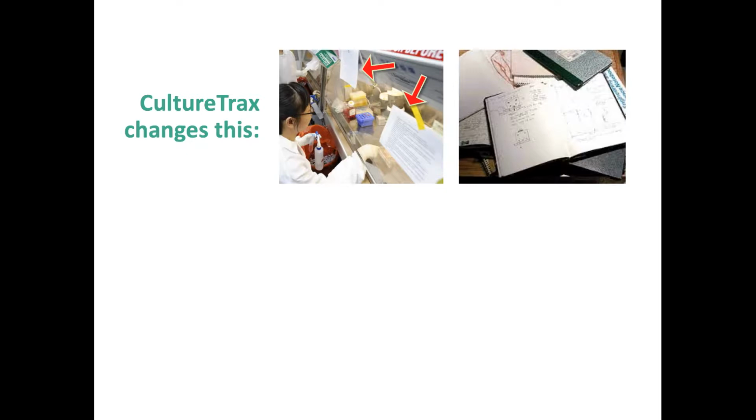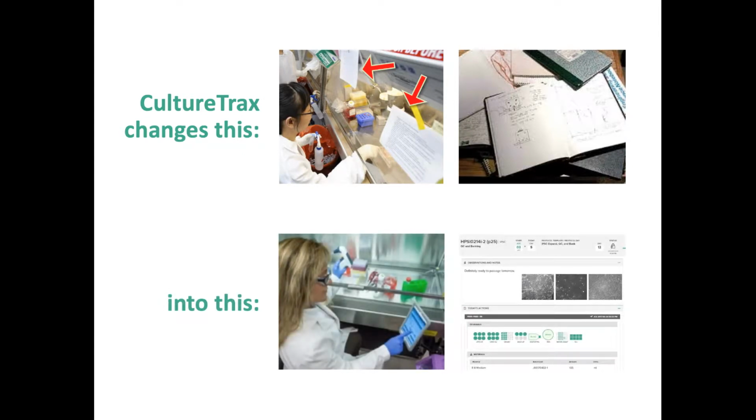About 4 years ago, we began to look into this challenge. We realized that although there is a huge data management issue, virtually all stem cell scientists we talk to are using classical data management methods centered around the paper lab notebook. In addition, methods for capturing and sharing protocols are fairly primitive and really not up to the challenges of 21st century science. So we set out to create a domain-specific electronic lab notebook for stem cell science. As we worked on this, however, we realized that the real need is for a common data language designed to facilitate the transfer of information between stem cell scientists and to make the process of doing the bench science itself more efficient.